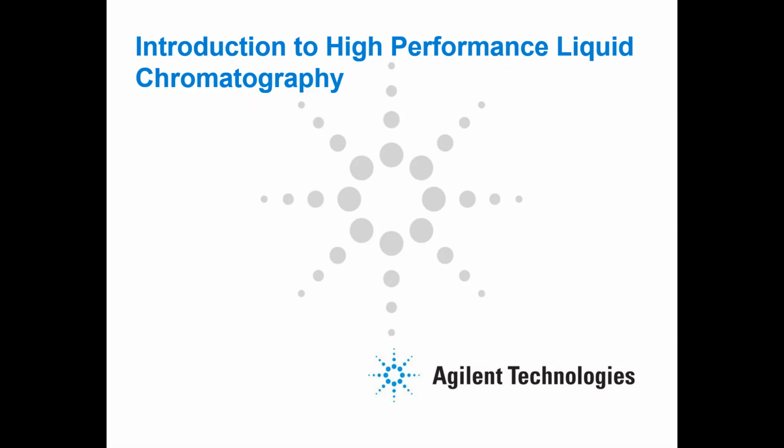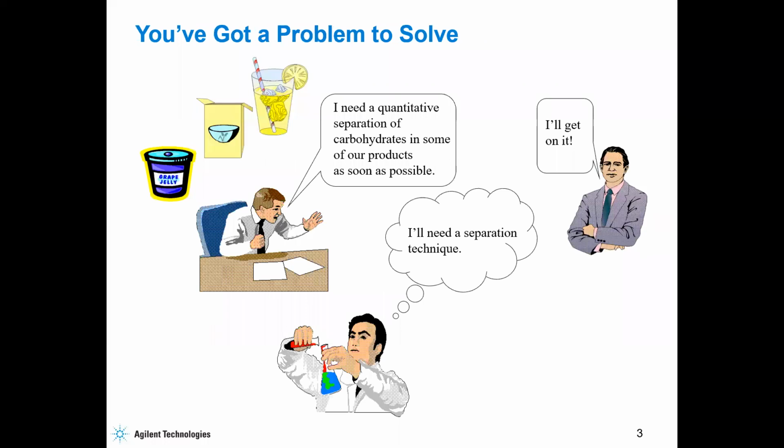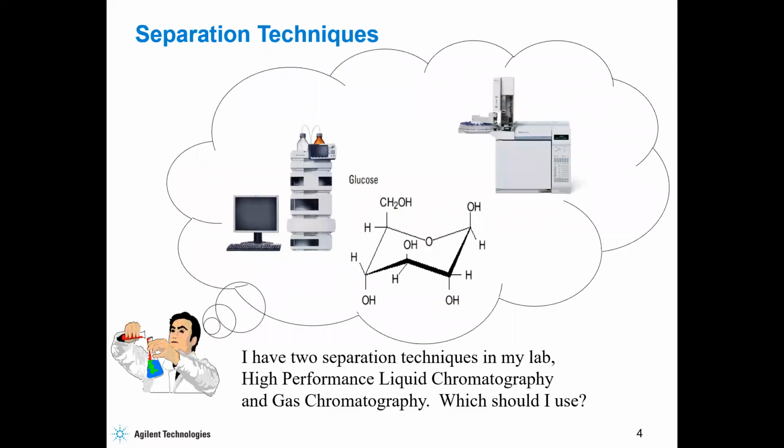So let's say at 3 minutes, there's no component eluting in my standards, and none of my standards had an elution time of 3 minutes. I inject my sample, and at 3 minutes there is a peak in the chromatogram. That means that it's not what I'm looking for that is eluting at that particular retention time. Is that clear? Okay, thank you. I also want to ask something else, please. Okay.